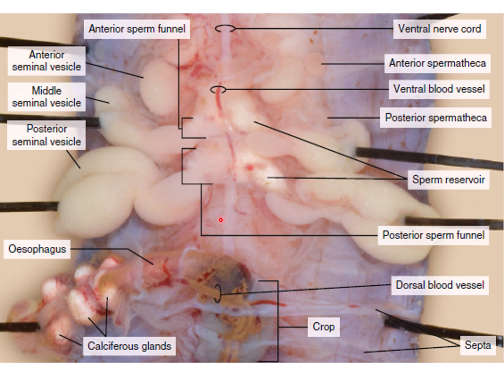They are transferred into the two small vas deferens or sperm ducts, and these sperm ducts carry the sperms towards genital pores in segment number 15. These structures are very small, they cannot be easily found. So sperm funnels could be found if the dorsal wall of the seminal vesicles is removed.